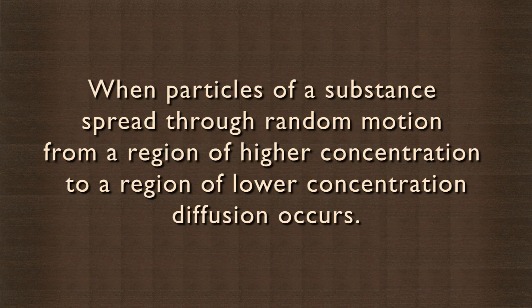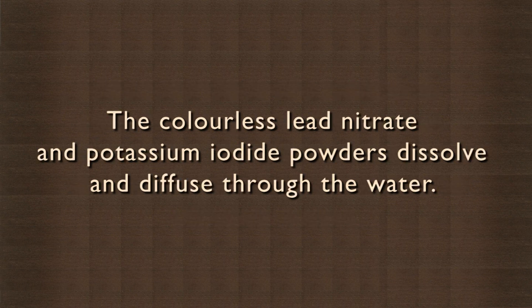When particles of a substance spread through random motion from a region of higher concentration to a region of lower concentration, diffusion occurs. The colorless lead nitrate and potassium iodide powders dissolve and diffuse through the water.